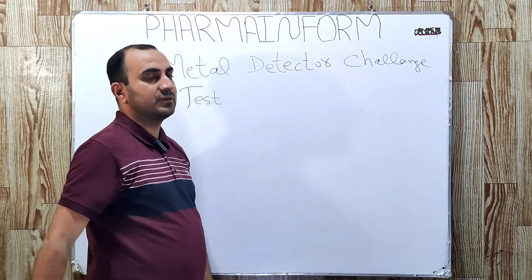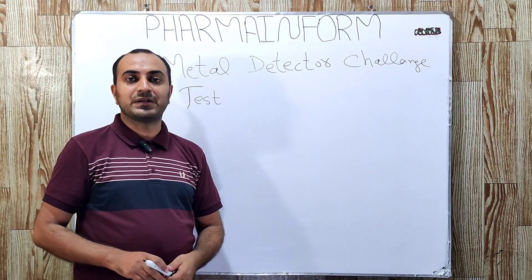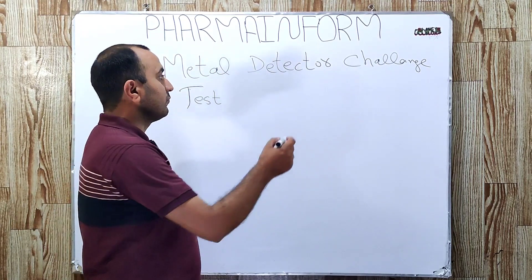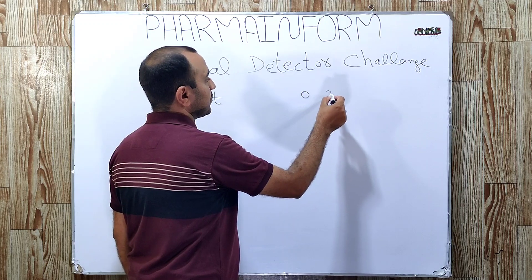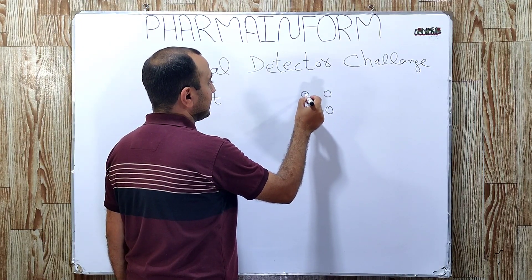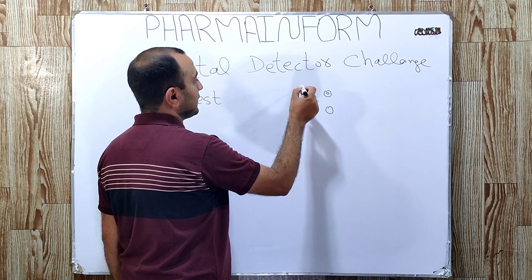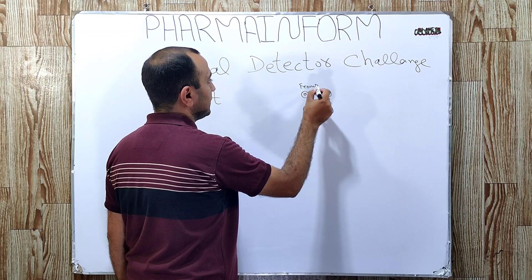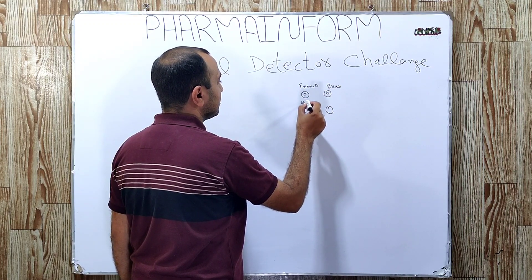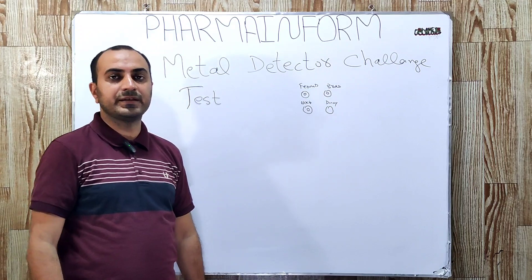We will challenge our metal detector with tablets that already contain metals. We have 4 pre-form tablets which contain various pieces of metals, passed one by one through the metal detector to check its efficiency. These are round-shaped tablets containing a specific metal: one tablet containing ferrous, one containing brass, one containing nickel, and one is a dummy — meaning it does not contain any metal.